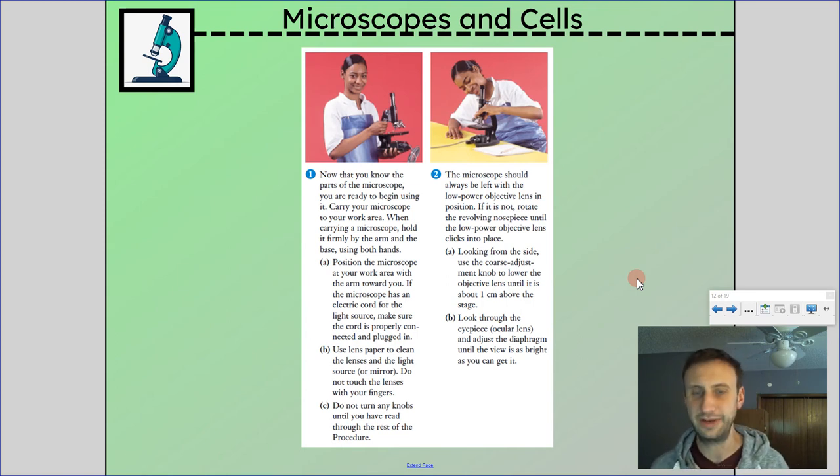You know, that's interesting. I've always actually had the microscope the other way with the stage towards me. I like that better, but this is suggesting the opposite way. Maybe it's a user preference thing.